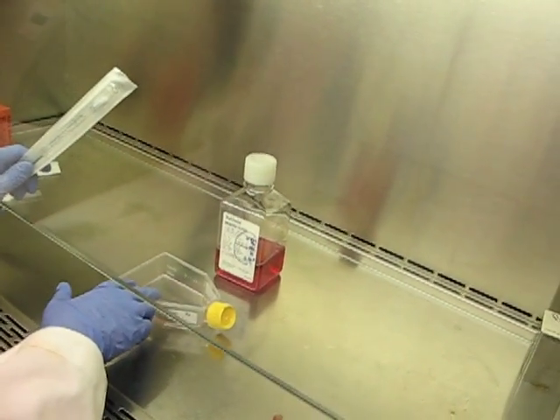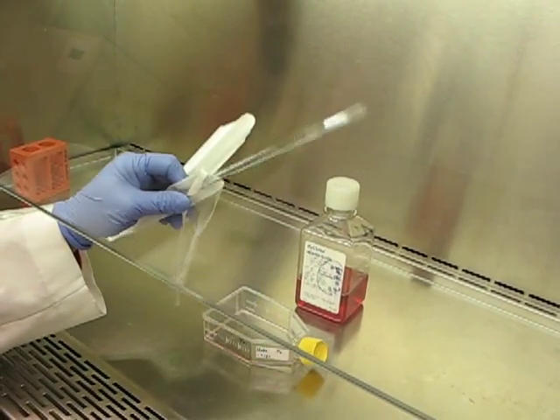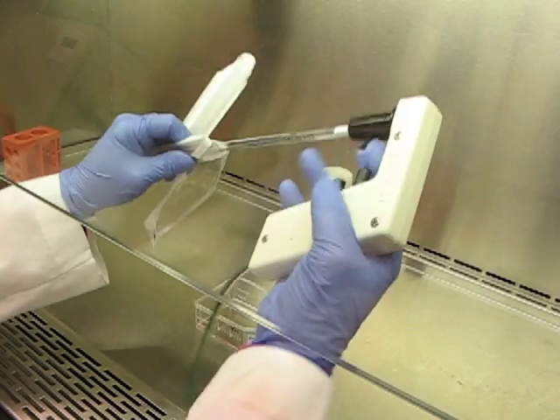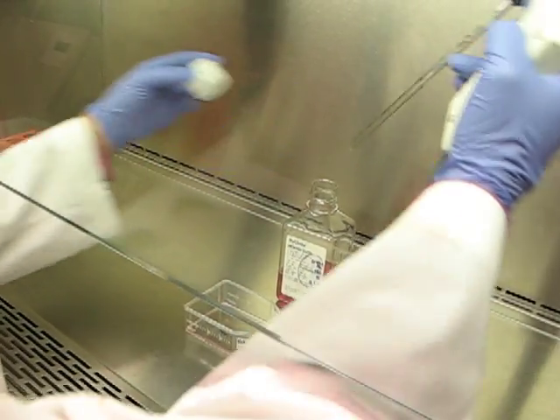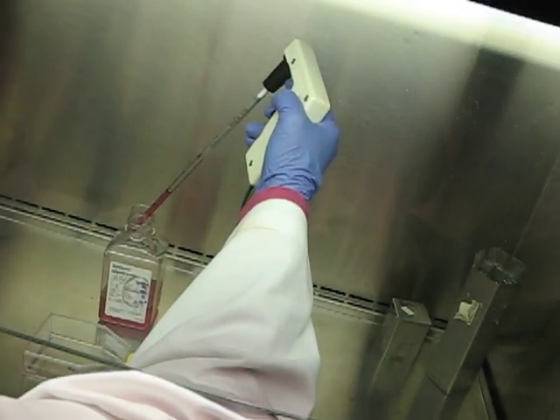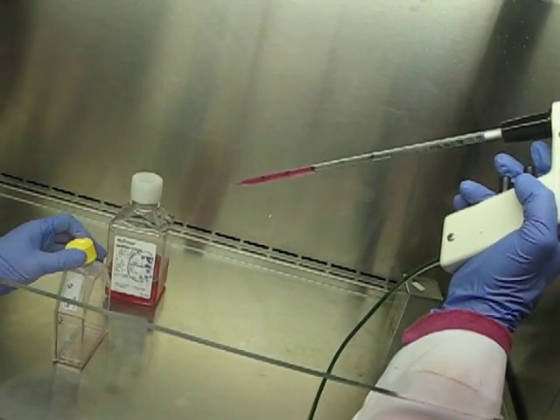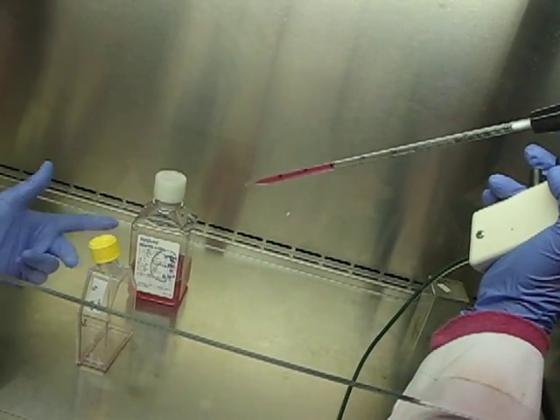This flask happened to be about ninety percent confluent, which is probably somewhere between four and five million HeLa cells. What I'm going to do is add three mils of media, so I'm doubling the amount of media that I'm adding compared to the amount of trypsin. But if you wanted a really concentrated cell suspension, you'd only use one and a half mils.